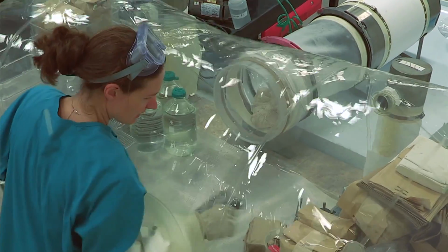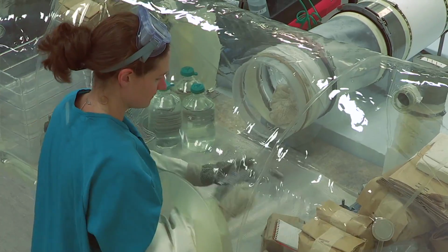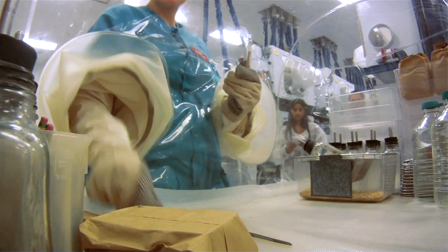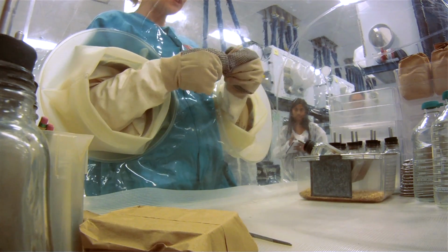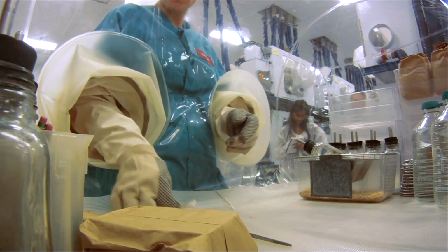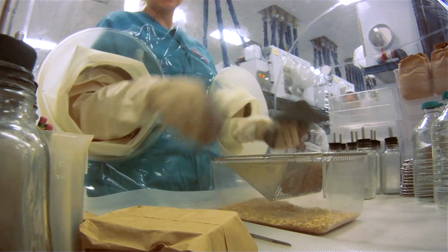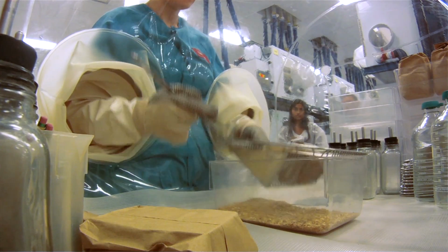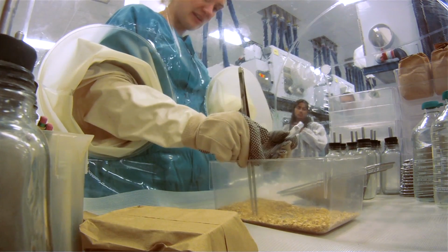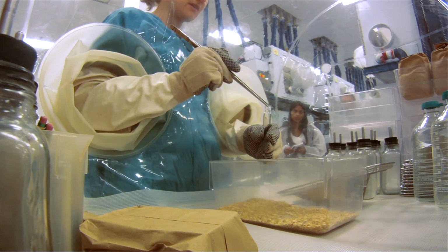So for the microbiological monitoring, we are using these little glass culture tubes with swabs. For this, we only need 2 swabs. And what we're doing is, for each of the cages that contain animals, we take 2 pieces of the dirty bedding, and then we'll take 2 pieces of fecal pellets.